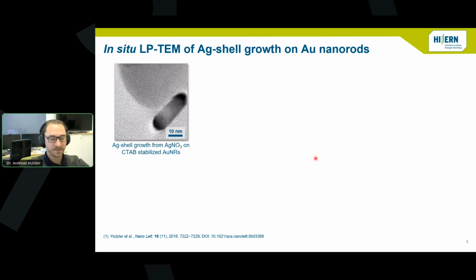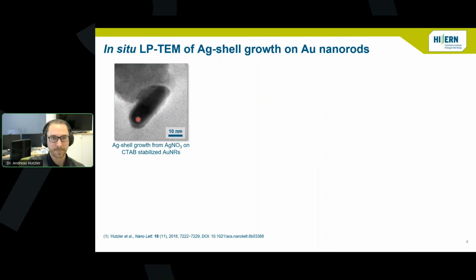Back then in 2018, this was a very first publication from our team, and there we finally come to the topic of nanomaterial synthesis, where we studied silver shell growth on gold nanorods. What you see in this video is a gold nanorod, and upon electron irradiation we grow this shell around it. And you see another particle above, which is dissolving when you look closely.